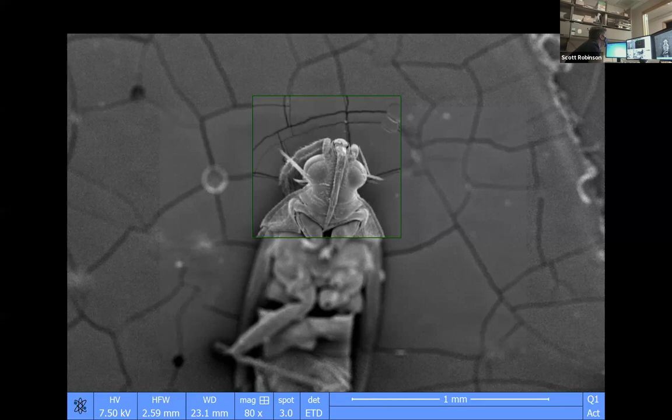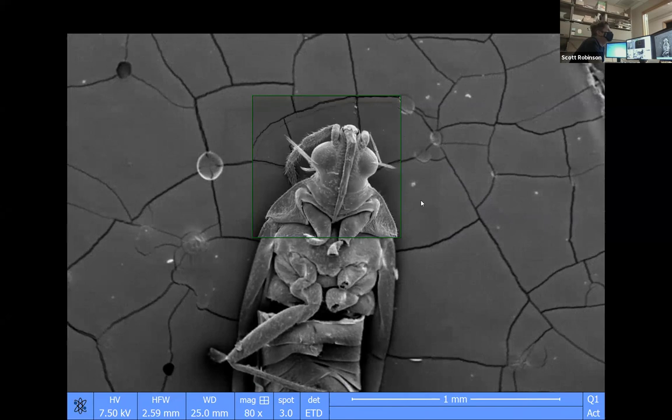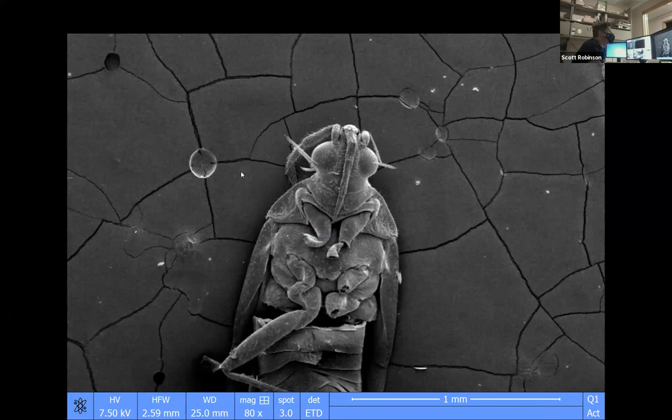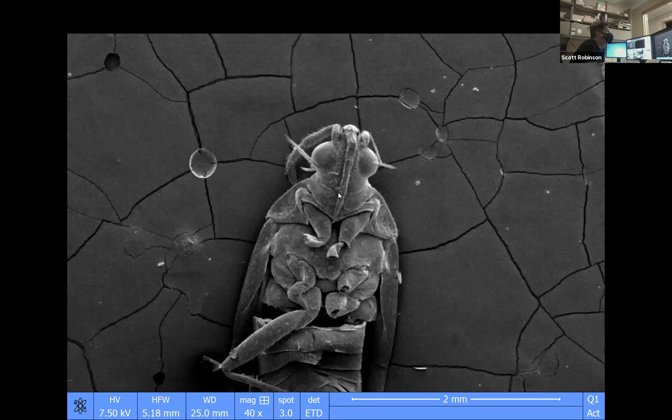So we can see that it's a true bug, right? Yeah. And we can see that its legs have busted off, so it must have been rolled a little bit. And we can also see that the rostrum may be broken or bent. This is called a minute pirate bug. I think it's called minute because it's really small. You can see that it's only about 2 millimeters long. So this is a very small bug, and we can call it a bug because it's a true bug.